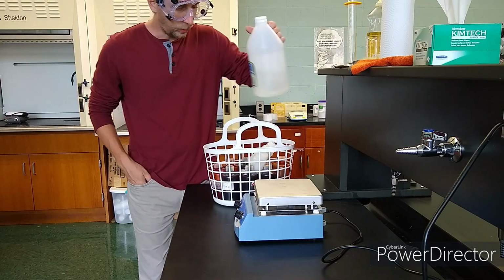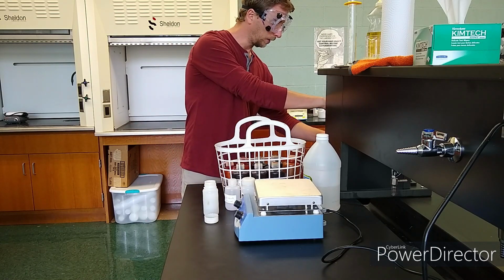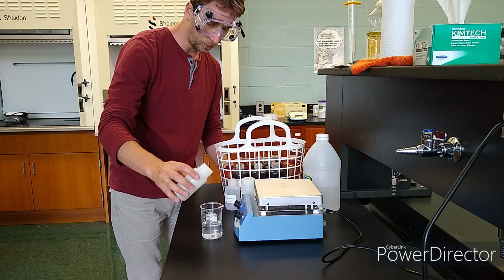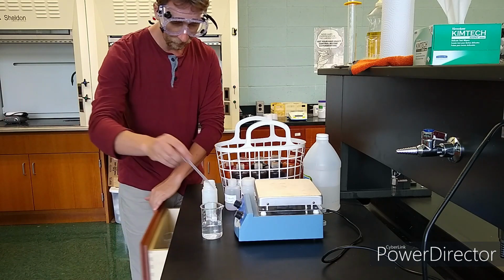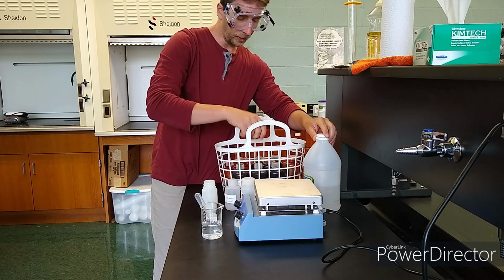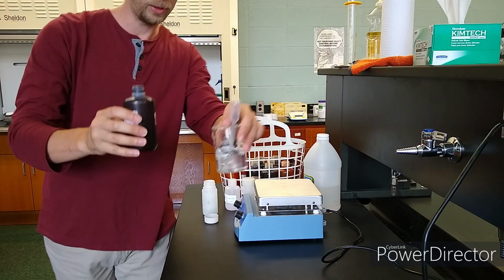Alright, so a really easy way to check that starch solution. The easiest thing to do is just put some water in a beaker. Put a little dollop of the starch. Stir it, stir it, stir it. You can even add a little taste of the vinegar if you wanted to, but we don't really need that for this little check. Okay, you ready? Let's see if it works here.